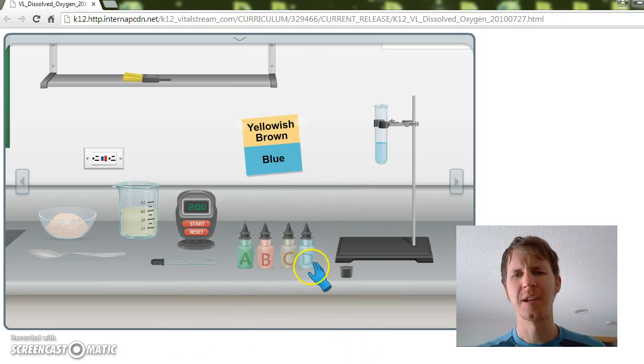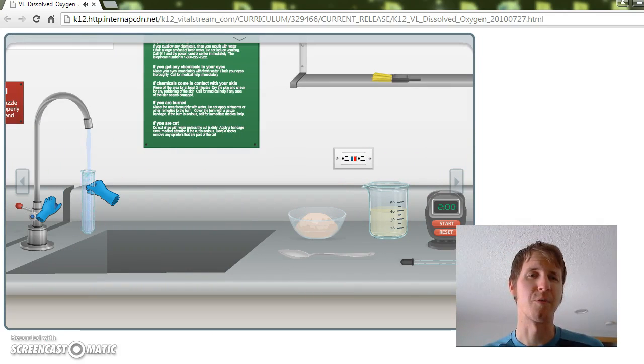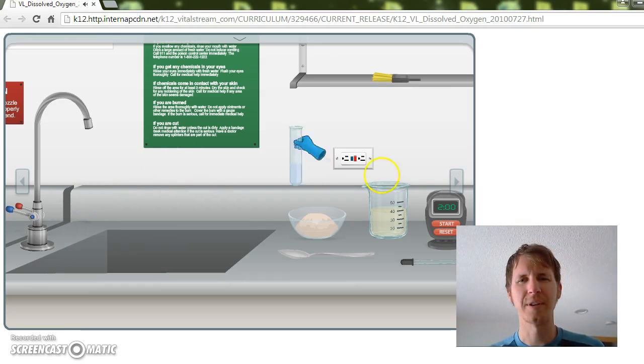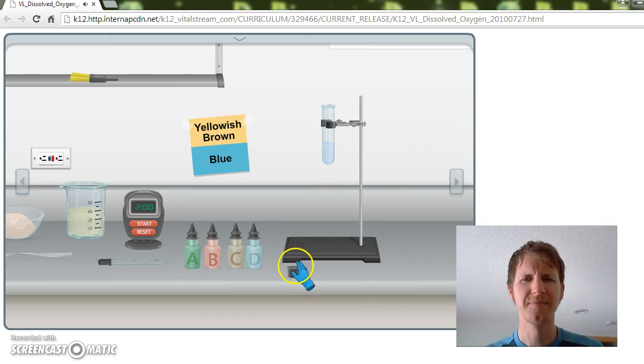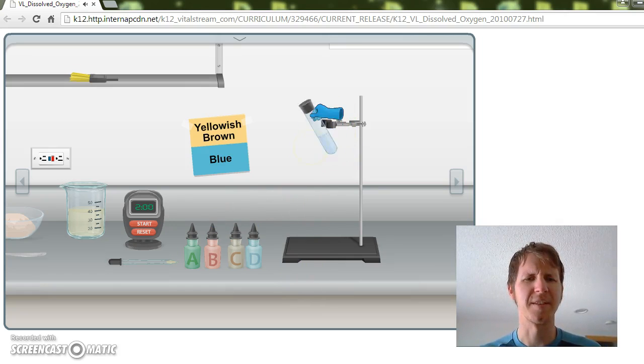What I'm going to do is stop the recording again here, and then I'll restart it when we get to a point where we can continue. So what I'll do first, before I stop the recording, is wash out the test tube and say, all right, we're going to use 2 drops of yeast. We'll shut that and shake it up and run our experiment, and then I will return when we're done with reagent C. The sample will be brown and we'll see how many parts per million the sample has.